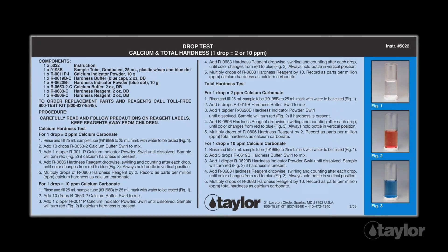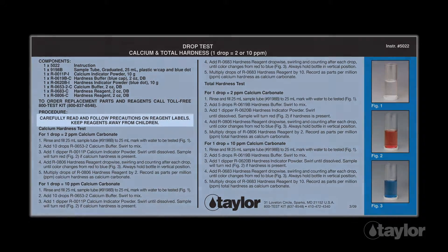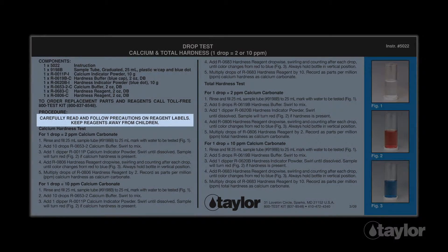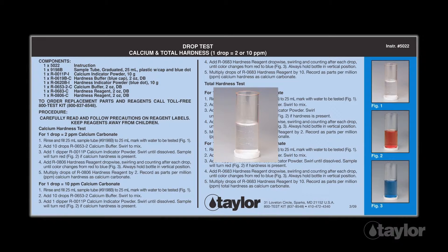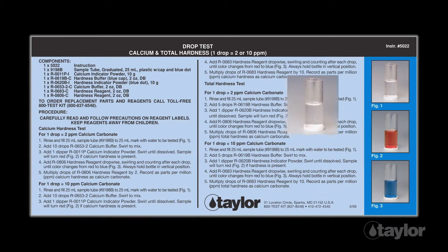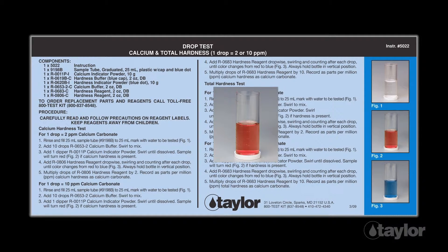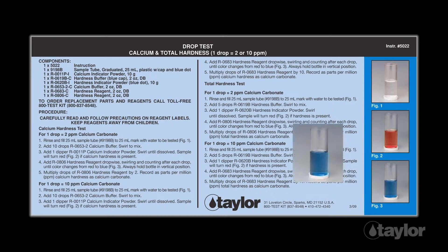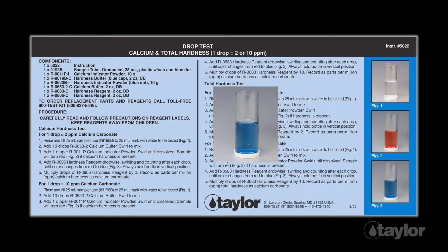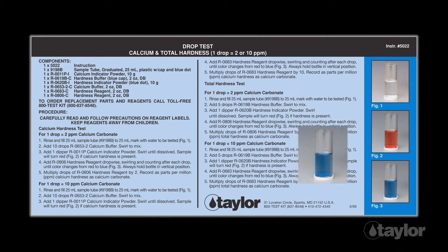Before beginning this or any other Taylor test, it is best to read the instructions through to the end. Familiarizing yourself with all the steps to come is particularly important if the test is new to you or if the kit is newly purchased, as sometimes our procedures change.